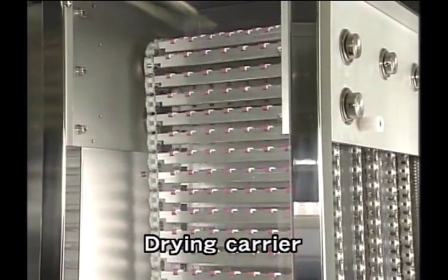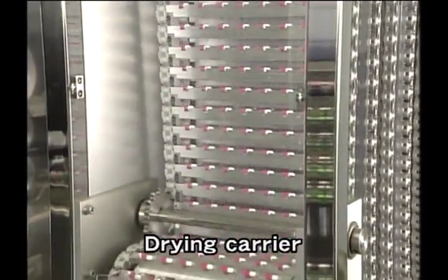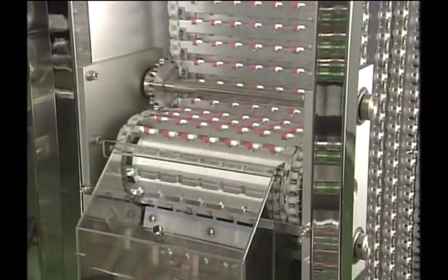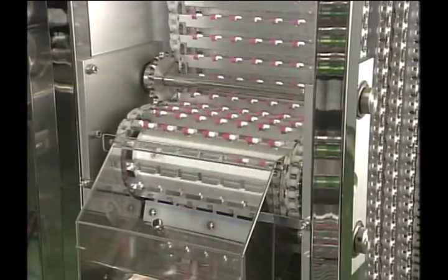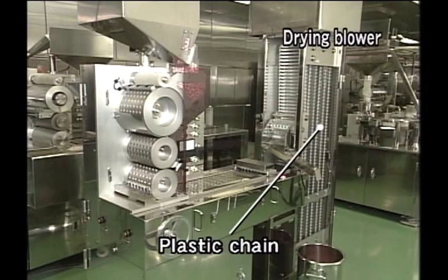The sealed capsules are moved to the carrier from the conveyor belt slat and are transported into the drying unit. After filtering, room air is provided at a constant room temperature to the drying unit without heating, and drying is done by spraying air onto the seal. This achieves drying of the seal without any decrease of the water content there.